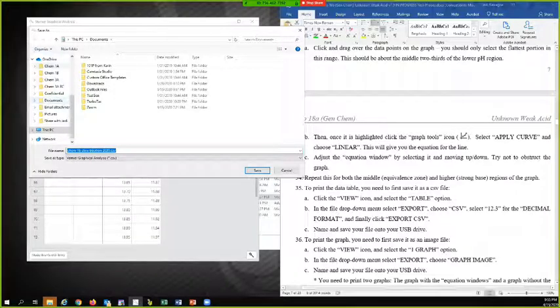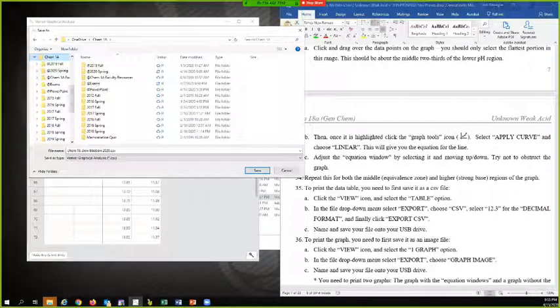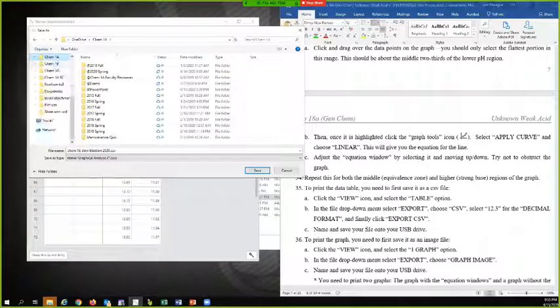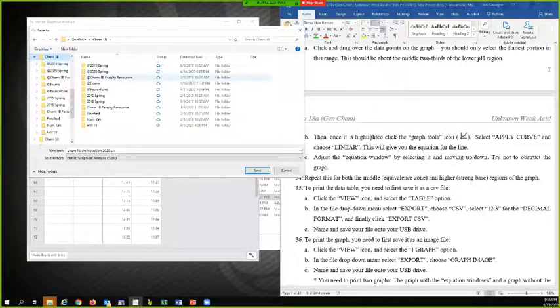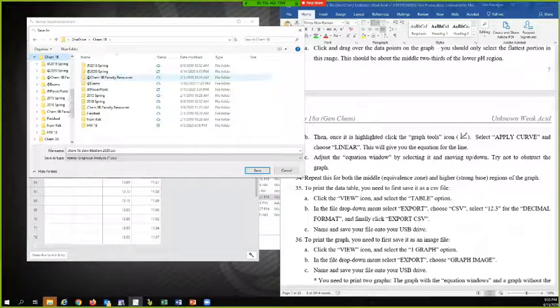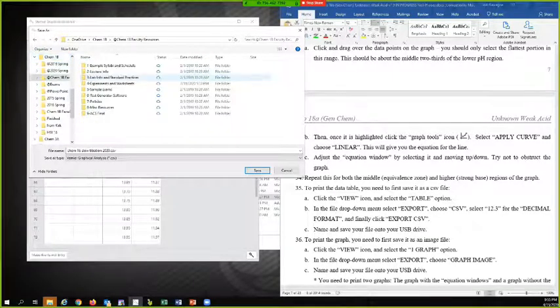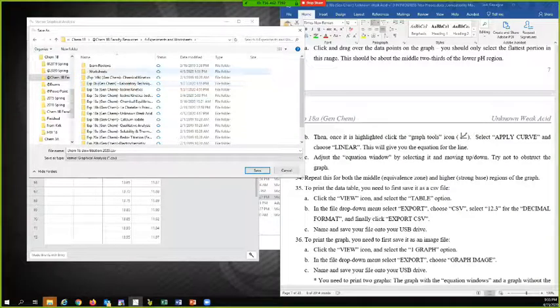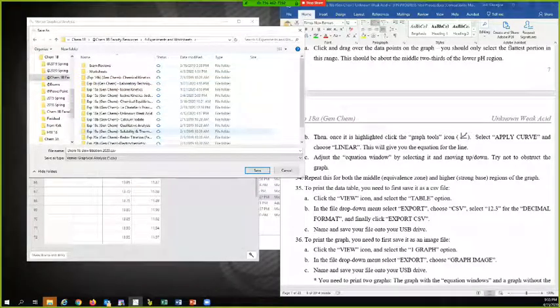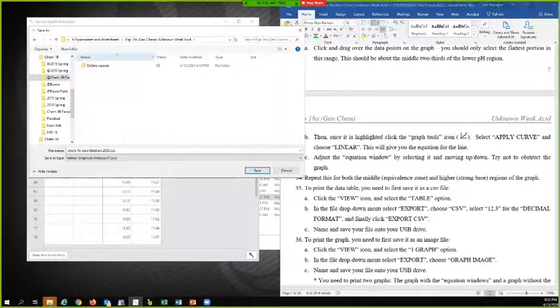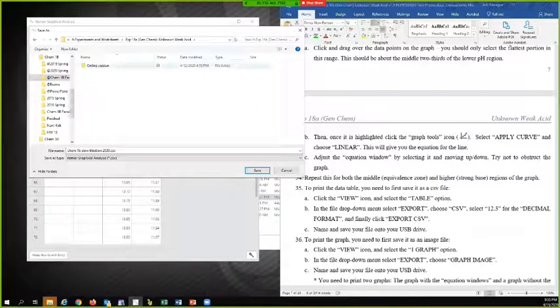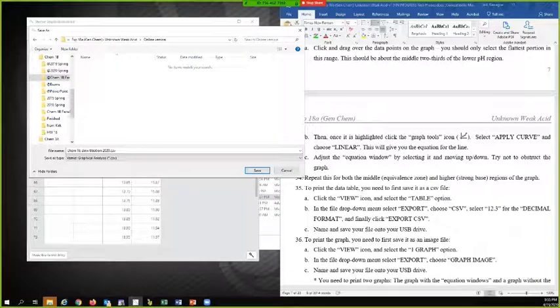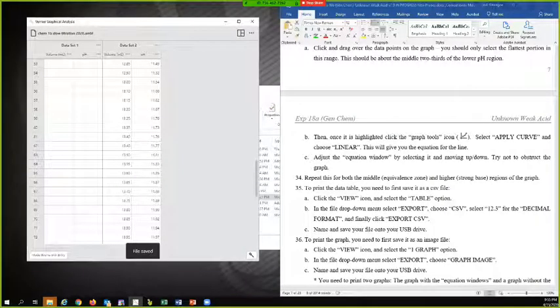And then you need to save it somewhere. I'm going to go and save it actually somewhere useful. File saved.